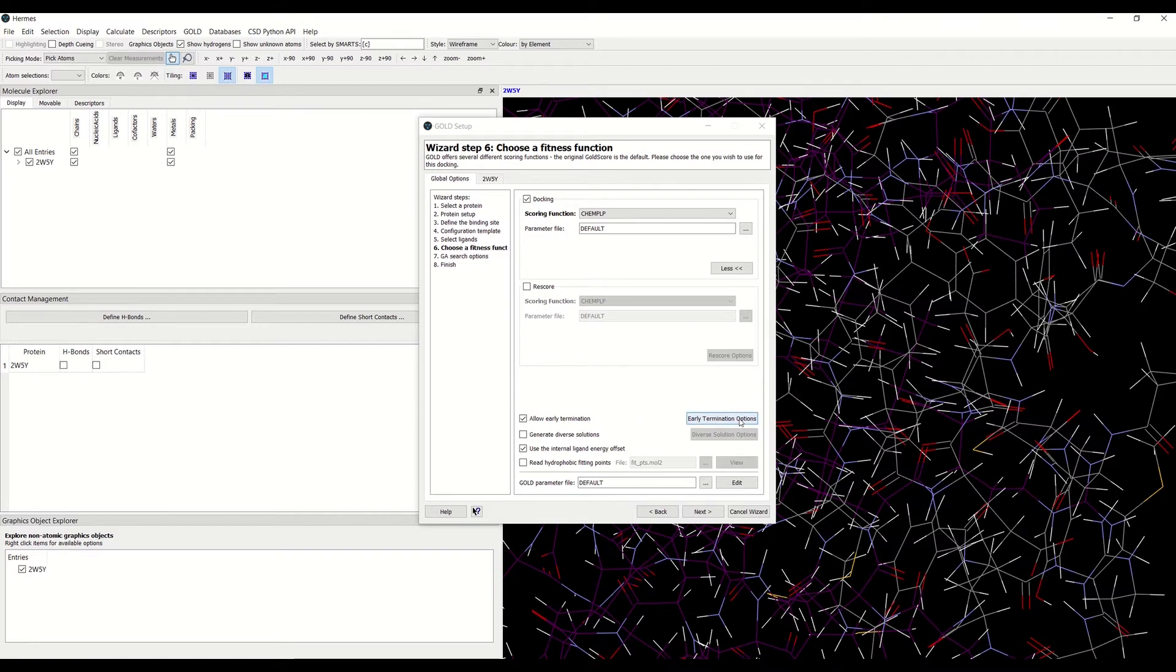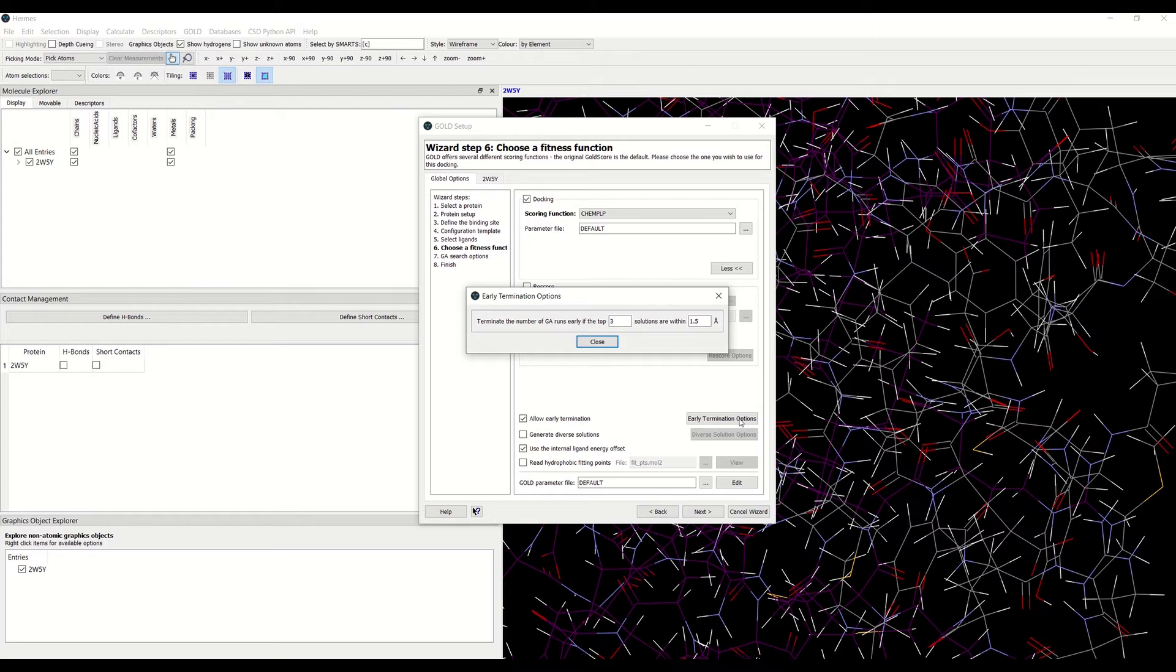Here GOLD has been instructed to stop docking a ligand if it reaches a state in which the best three solutions found so far are all within 1.5 angstrom heavy atom RMSD of each other.